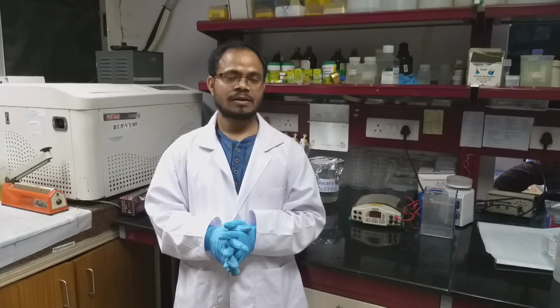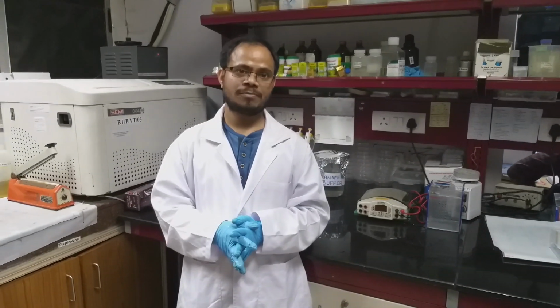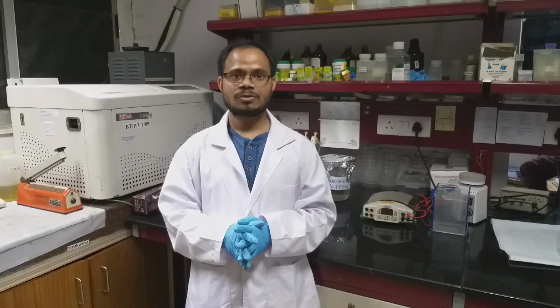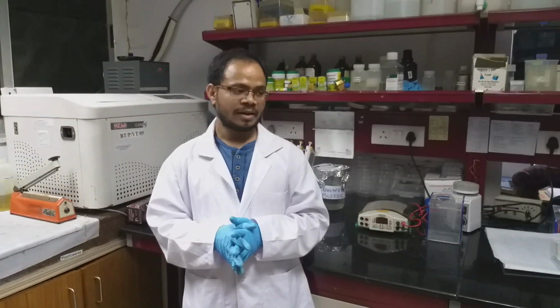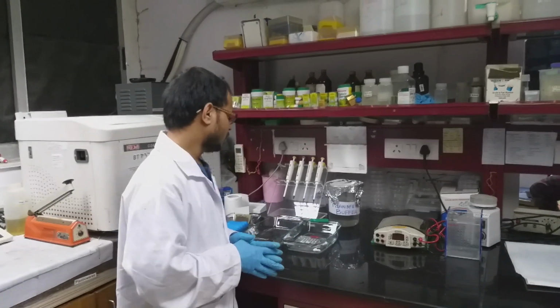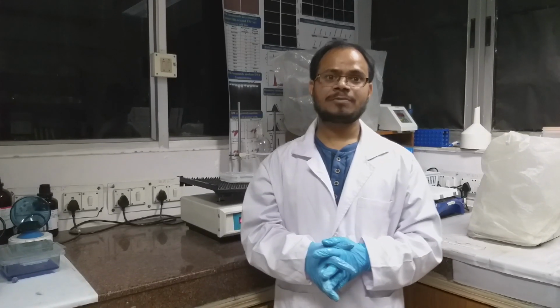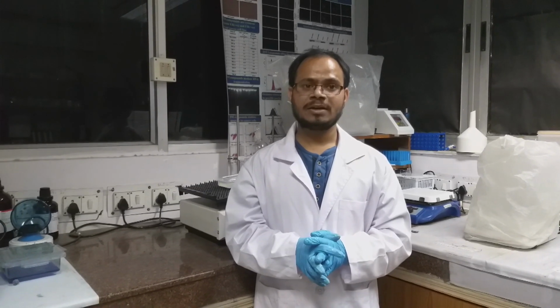Also, while handling the instrument, there is a possibility of electric shock, so use gloves then as well. After finishing the transfer, clean all the apparatus properly and dry it for the next use.